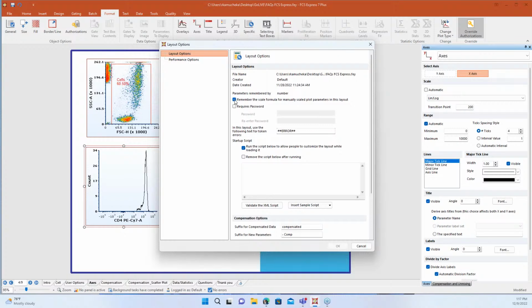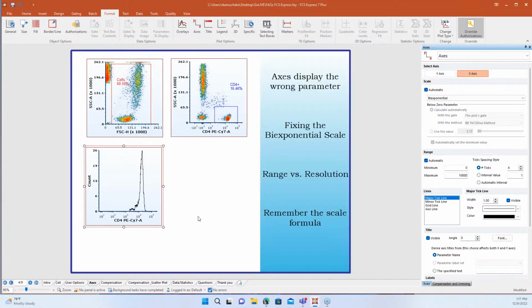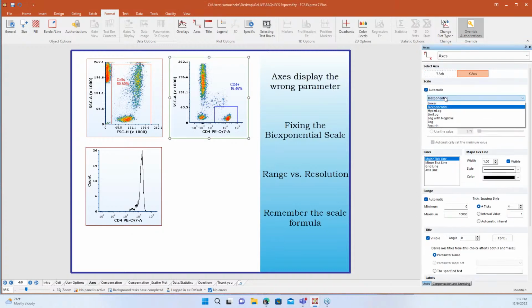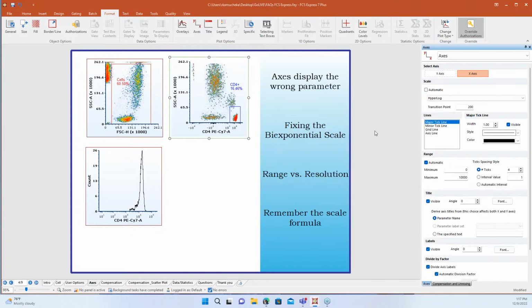So if you're seeing, ooh, yeah, I don't want it to use it for everything, I want to be able to change my scaling on one plot and not on another, just uncheck this box and click OK. And then you'll be able to just modify on your one plot here. Right, so then I can change this and it's not changing this bottom histogram for me. It's just limited to this one plot.